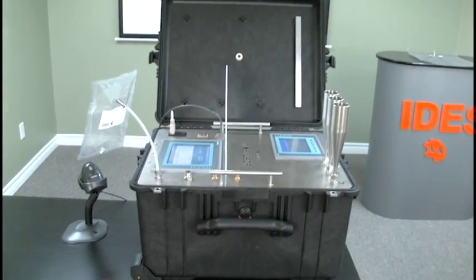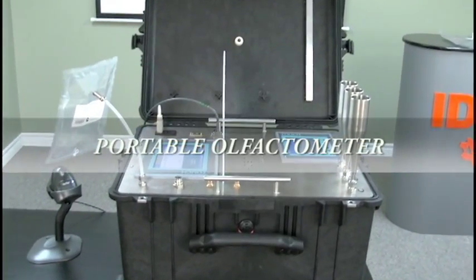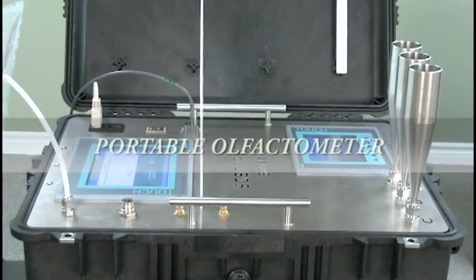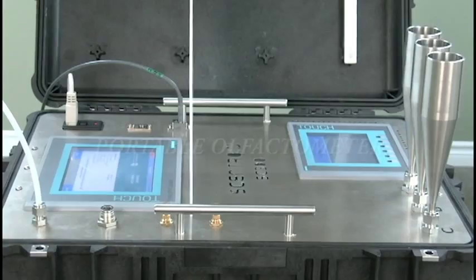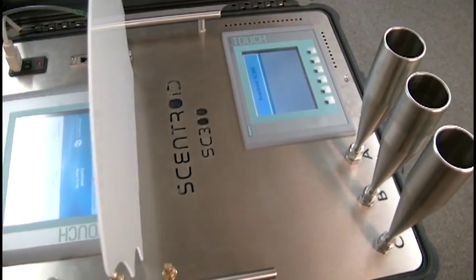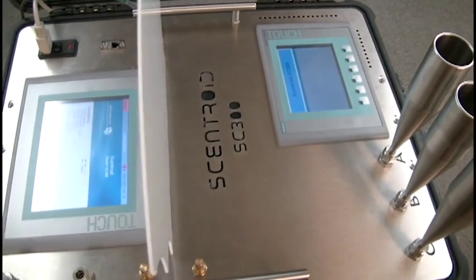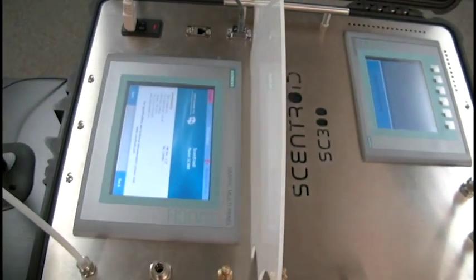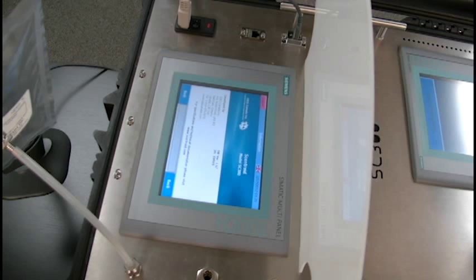The SC300 is a fully automated EN13725 certified olfactometer in a pelican case for ease of transportation. The SC300 has two stations: a panelist station and a dedicated administrator station, separated by a partition.